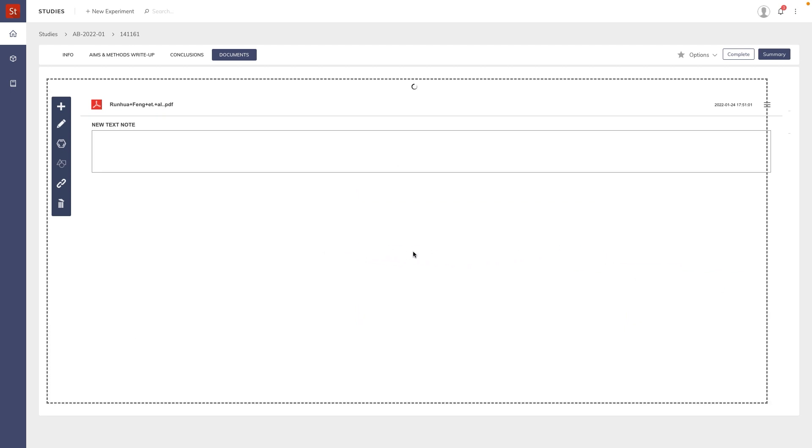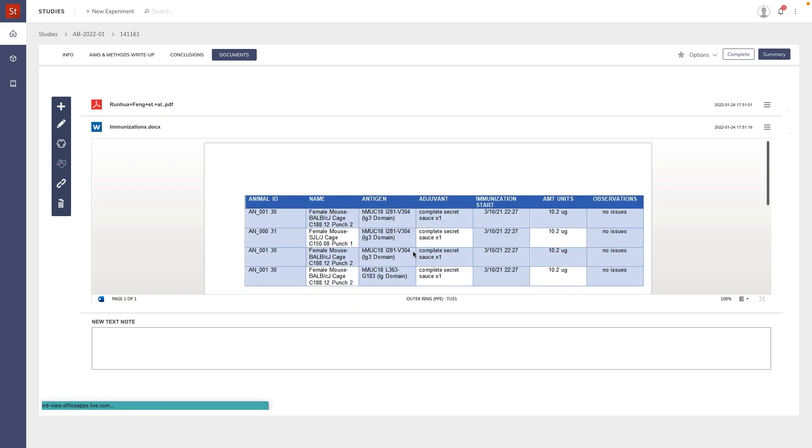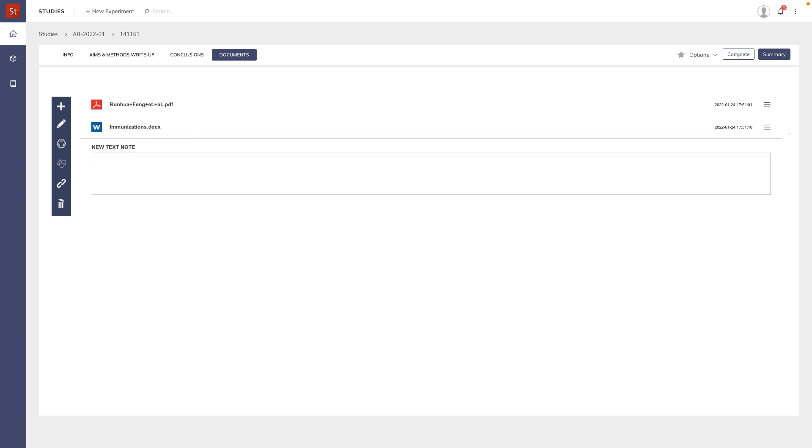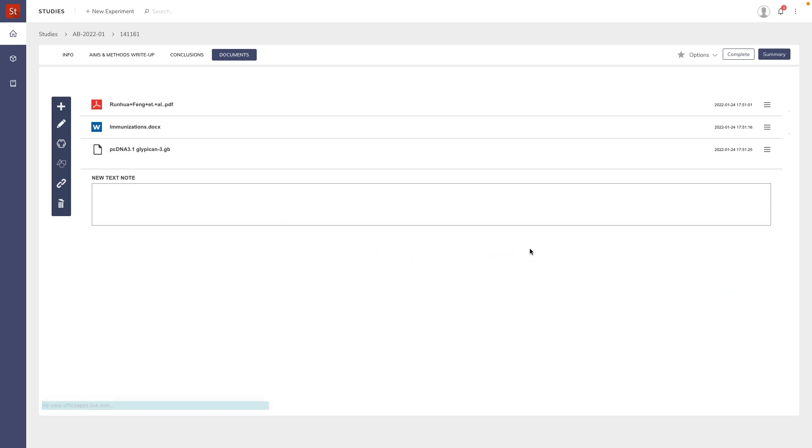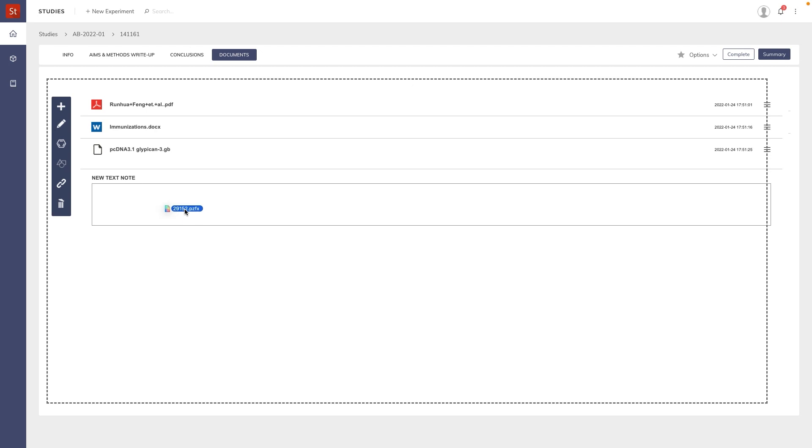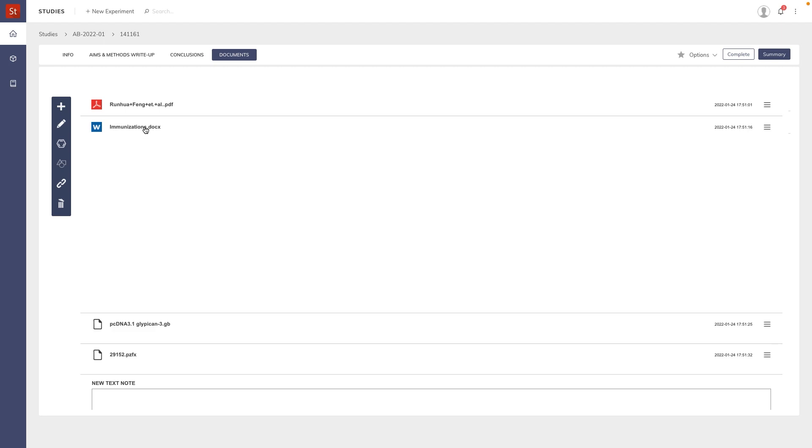A Word file, a GenBank file, and a GraphPad Prism file. Any kind of document can be added and many can be previewed.